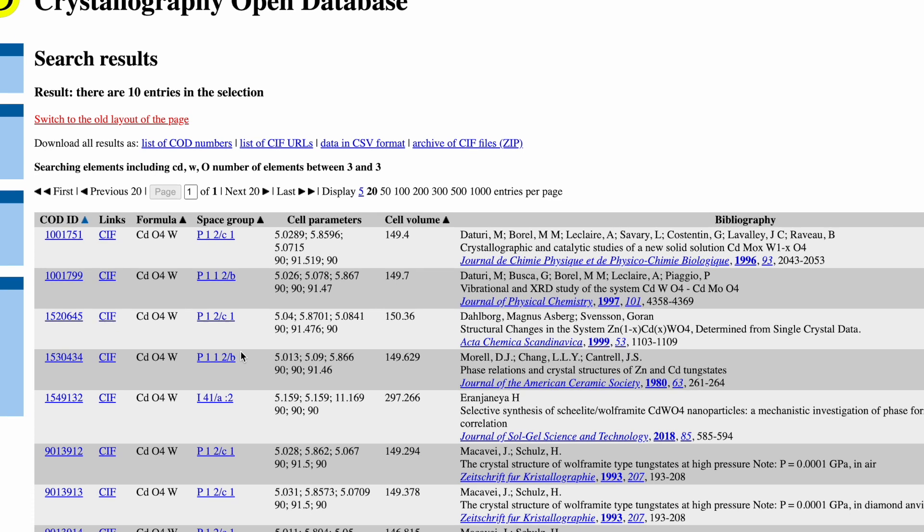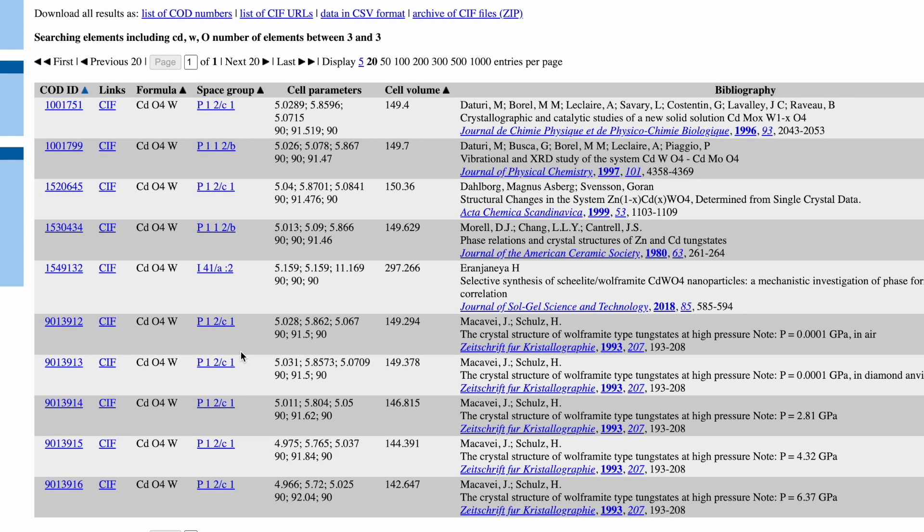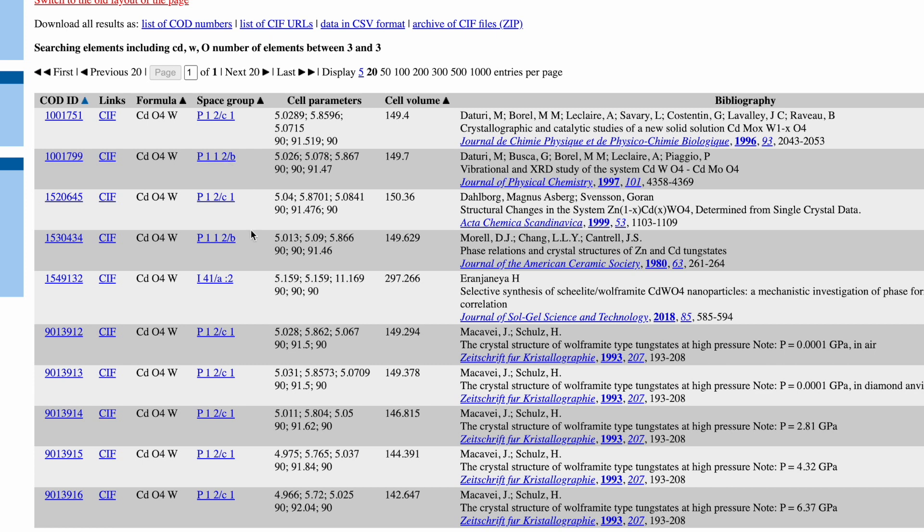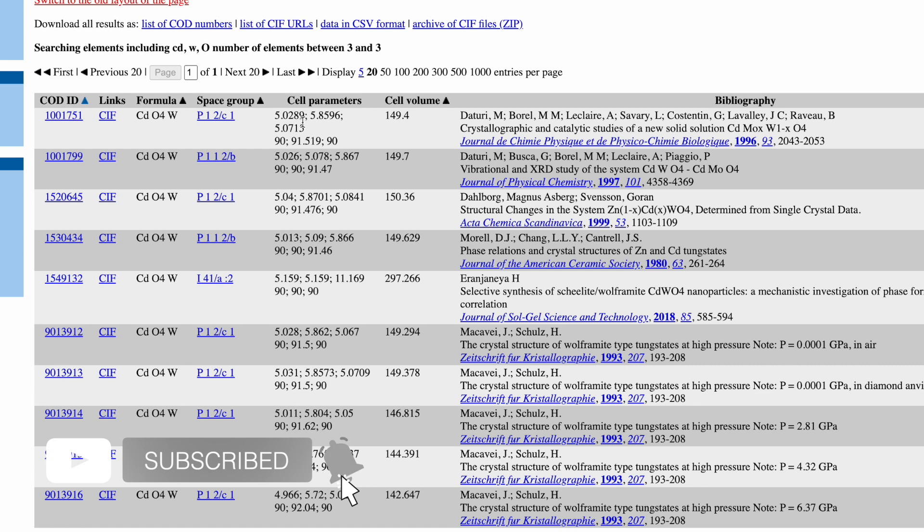It will take you to the search results. On this page you will find different results which are reported by different research groups. Here you will see a link for the CIF file which has a formula of CdWO4, but it has different space groups. For example, the space group of one and the second is different, whereas the fifth one is different. And as the space groups are different, the lattice constants also are different. So now the question is, which CIF file is suitable for our XRD diffractogram? I will show you a way how to figure out which CIF file is suitable for our XRD diffractogram.